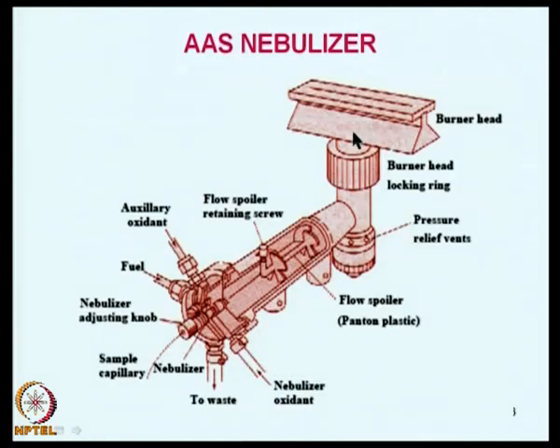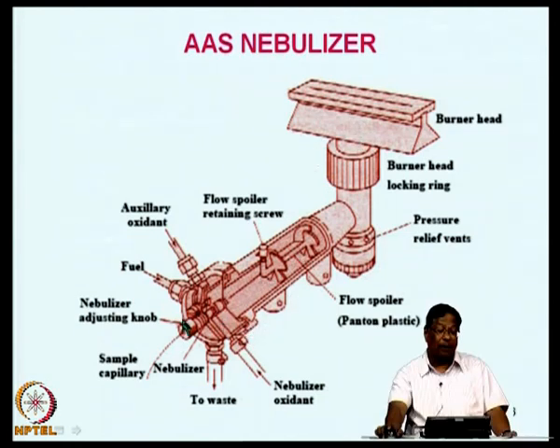Now, in atomic absorption nebulizer, it is slightly more complicated, but the principle remains the same. For example, this is from an atomic absorption nebulizer.